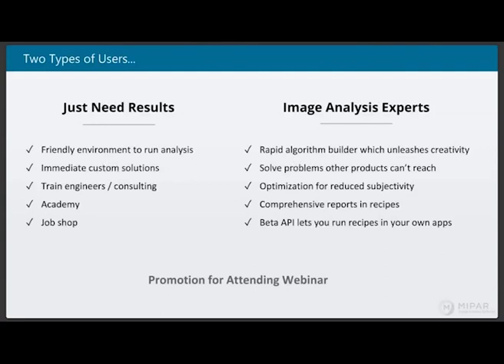Yeah, the channel operations can be quite powerful, and when we introduced the color deconvolution, it was really fun to use because it's a form of machine learning in a way. You know that there's some orange somewhere in the image, and it can be a struggle to come up with the right linear combination of red, green, and blue to brighten up the orange and dim everything else.